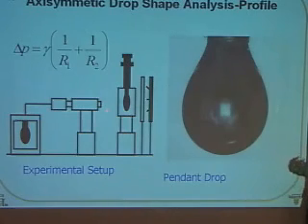I think what relates to the current workshop is that here we need image analysis and image processing, the edge detection and the curve fitting. These things are not trivial for normal engineers. Probably the computer scientists will be able to help us.